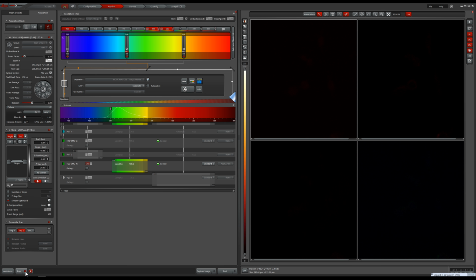Both methods have their use cases, but you will likely benefit from the first one as that one allows you to make sure you are capturing the in-focus plane that you center your stack around. Finally, the little garbage bin icon will delete your ZStack coordinates.